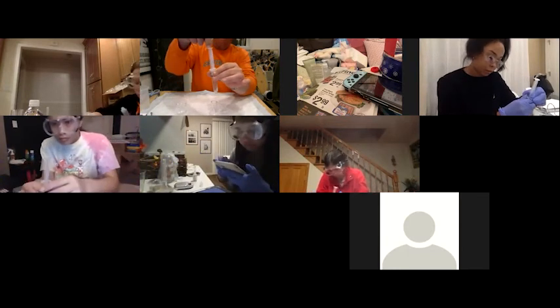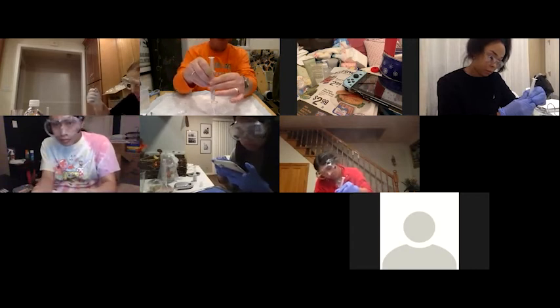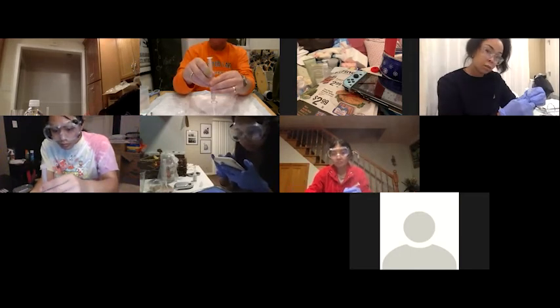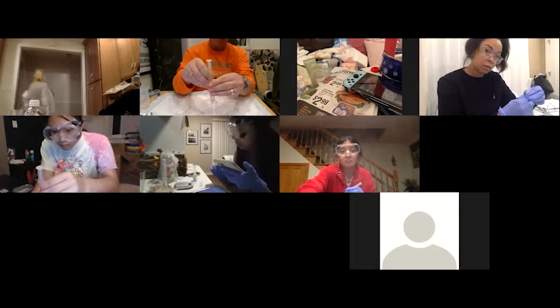So the way you do not want to dispense is like this, pushing down. What you want to do is push just a little bit at the base. Don't push from the top. That's just a little bit at a time from there. Sort of a gentle squeeze.